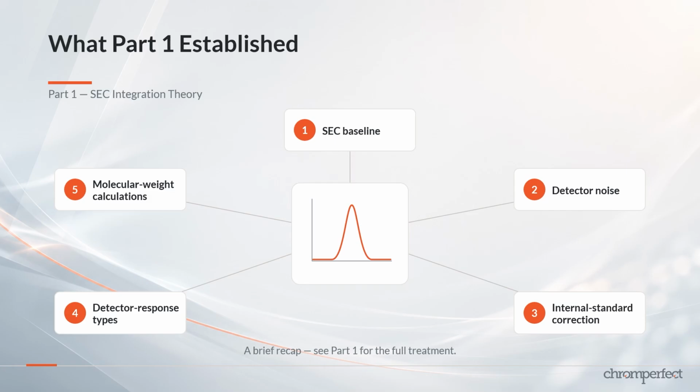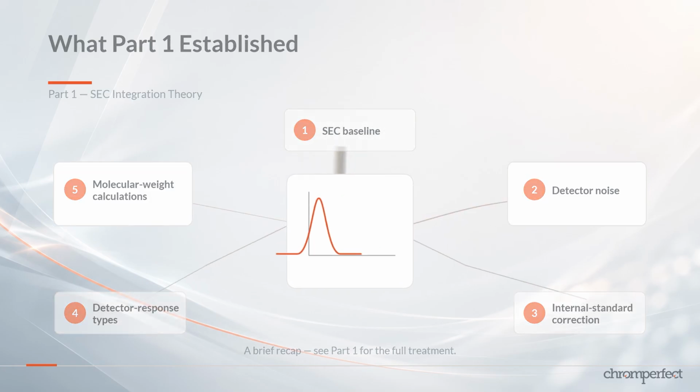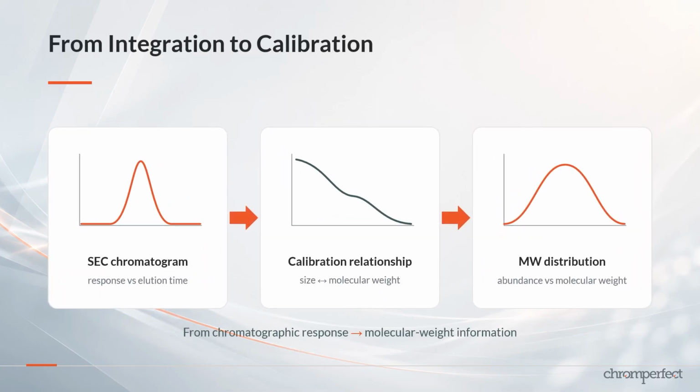We considered the dedicated SEC baseline, the treatment of detector noise, the use of an internal standard to correct between-run flow variation, the different types of detector response, and the calculations used to describe a molecular weight distribution. In this video, we will move from integration to calibration.